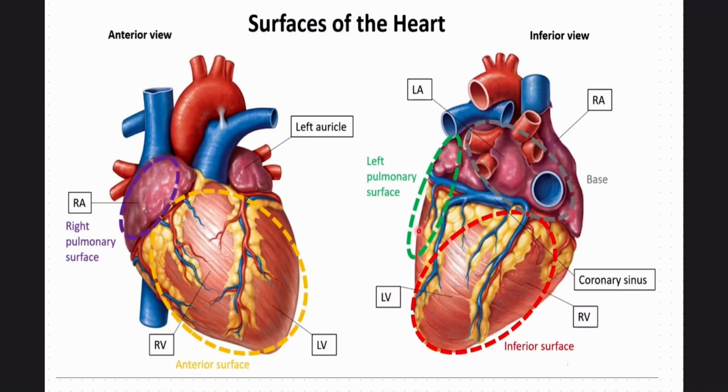Today let us study one of the autopsy techniques of the heart, that is the inflow and outflow method of the autopsy technique. This is one of the autopsy techniques of the heart.